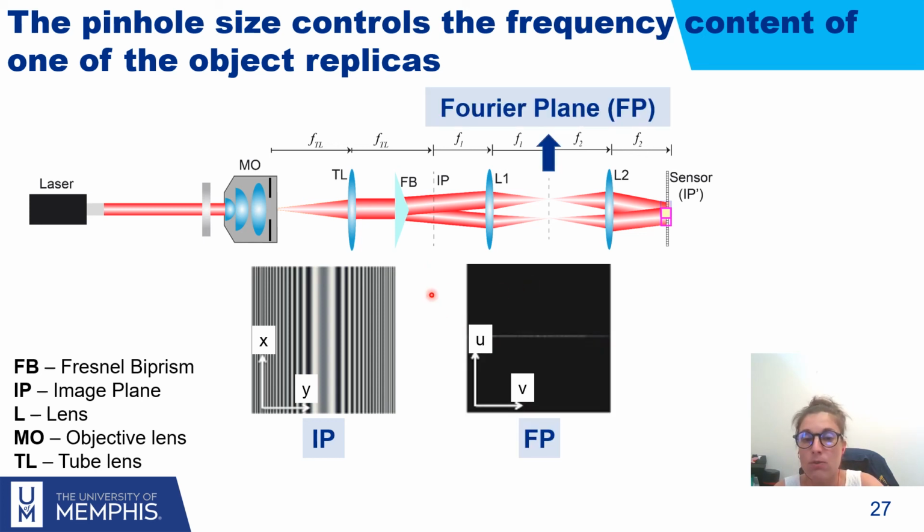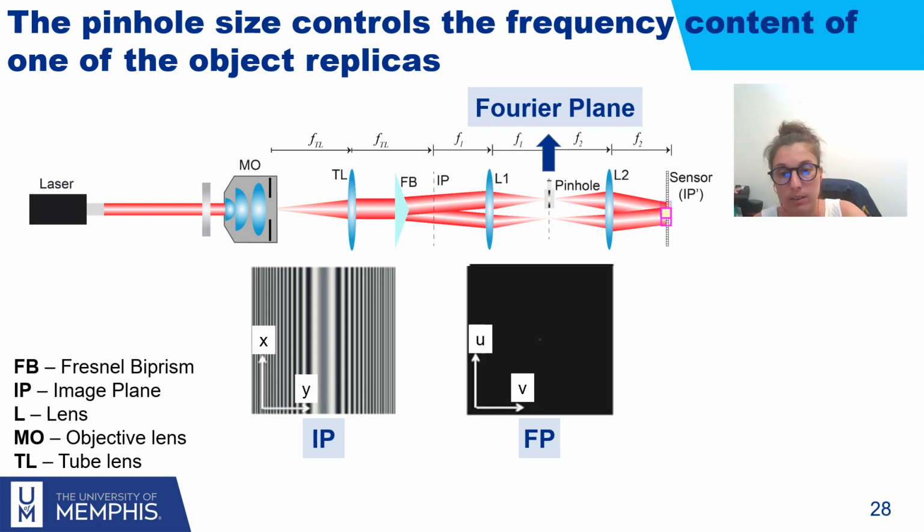And now, if you analyze the Fourier transform, which is the information that you get in the Fourier plane of the relay system, because it's invariant along the x-axis, you're going to have an infinite sum of frequencies along V, where V is the spatial frequency along, in this case, the horizontal coordinate, right? But all these infinite frequencies are going to get filtered.